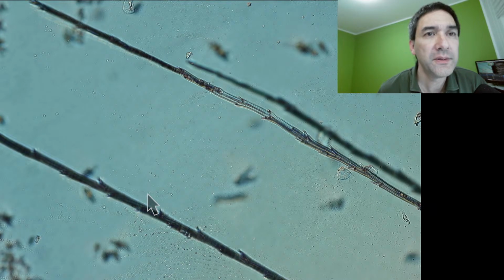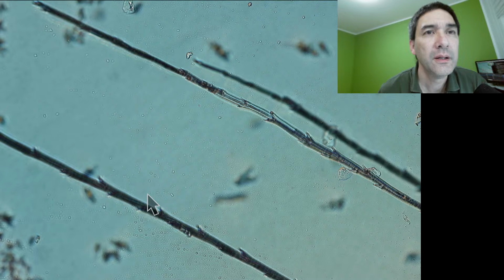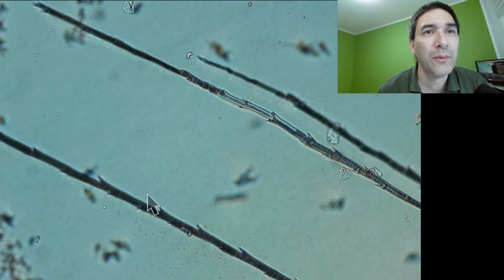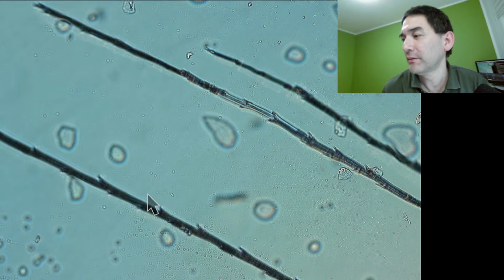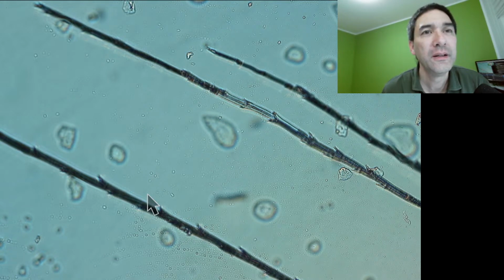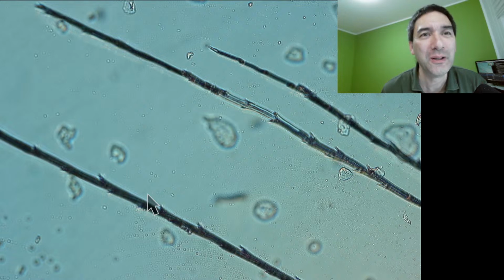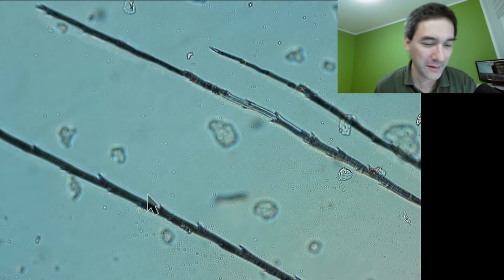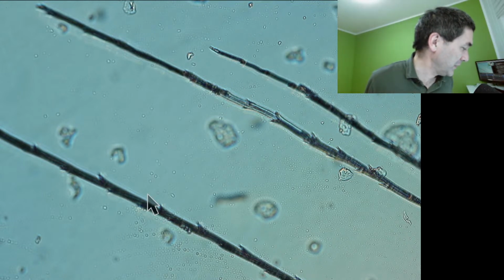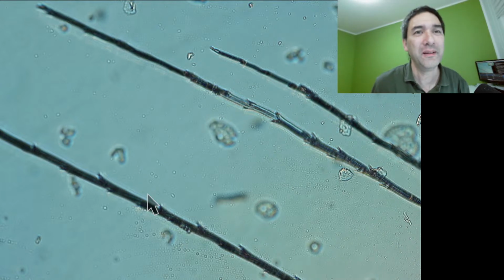So, some people are talking about cameras right now. I wonder how the tardigrades on the moon are doing. Ooh, see, this was actually some water spreading. Yeah, some time ago, they sent some tardigrades to the moon as well. The snail poop on the slide might get lots of digested algae. There was a little bit of snail poop indeed somewhere.